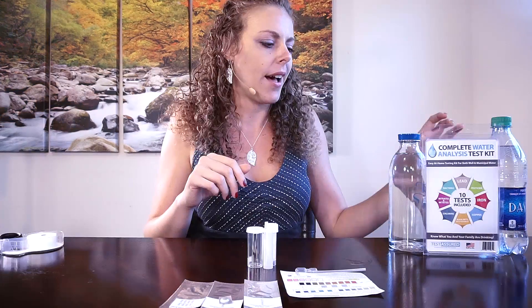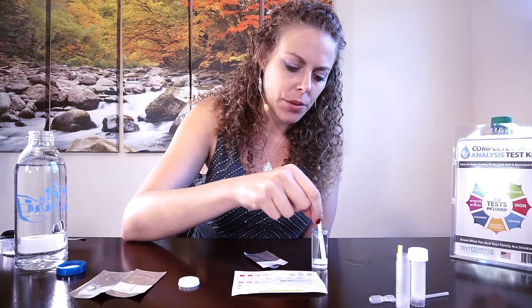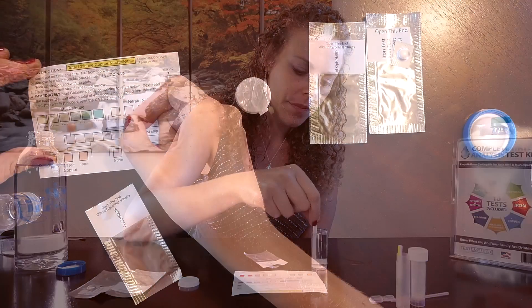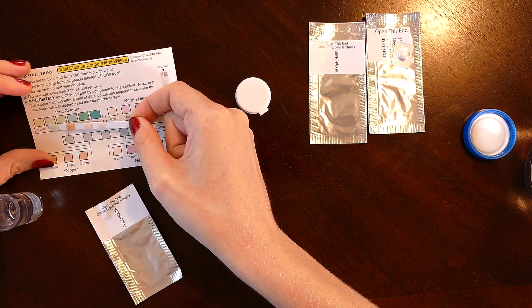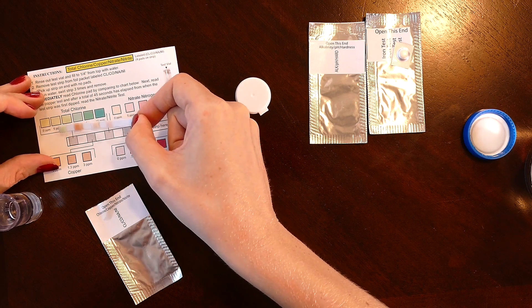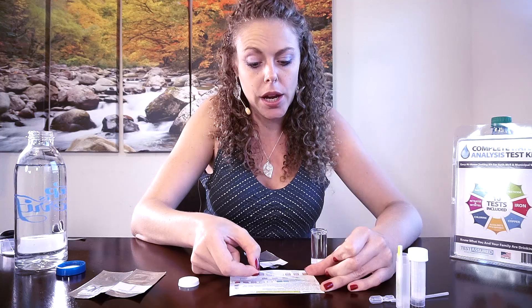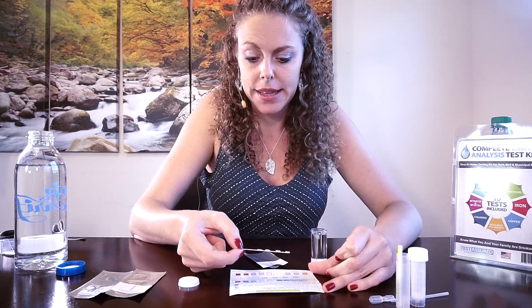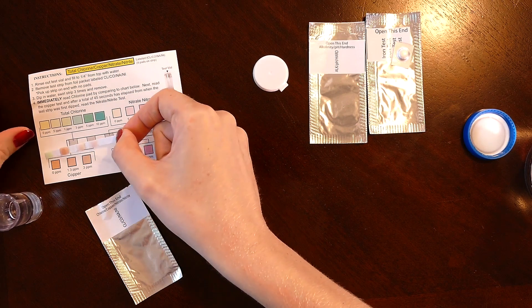Let's go ahead and test the tap water — it should hopefully look a little different than the filtered water. Starting with chlorine, copper, nitrate, and nitrite — putting it in and swirling three times. On the chlorine strip, this one is a little more on the green side than yellow, somewhere between 0.5 and one part per million. There's definitely some chlorine in this tap water.